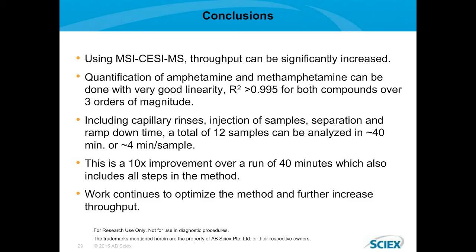Thank you for that. Our next question: how much sample volume is minimally needed in the nanovial for a reliable injection? Well, the nanovial was validated down to 5 microliters. To go any lower really depends on the solution that you're using, the viscosity, and whether you can actually get it positioned in the bottom of the nanovial. To date, most samples are dissolved in a fairly dilute background electrolyte and are easily positioned with a long pipette tip into the bottom of the nanovial.